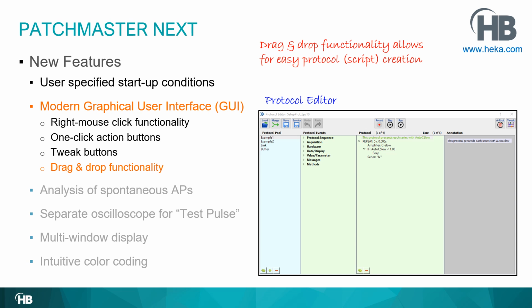The same is true with the stimulus editor, where you can change the stimulus sequences and then save all your stimulus sequences in one file. And the same is also true with the analysis editor. So in general, when you use the protocol editor, analysis, or stimulus editor, I would always recommend that the user saves first their own file. Do not save your changes into the default file.